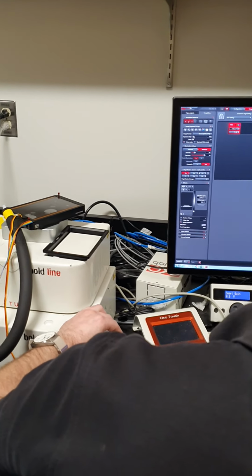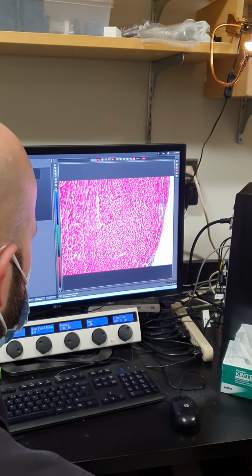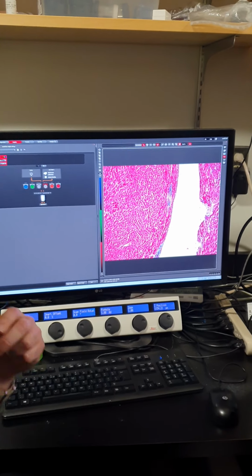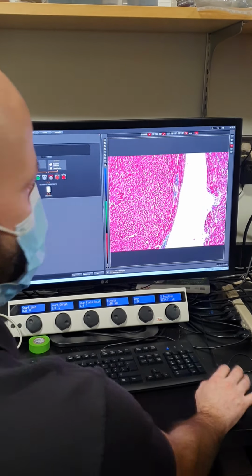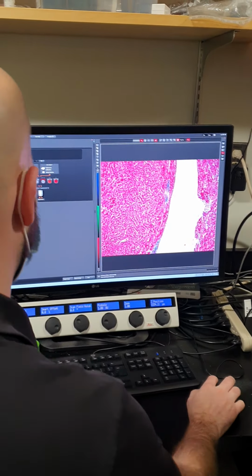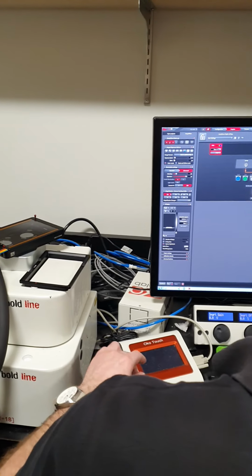And so this is a trichrome stain, so just healthy muscle tissue is pink, and then fibrosis is blue, for example, over here. If we're doing something like this trichrome staining, which is color critical, particularly if we're going to be trying to quantify it based on color, one thing that we probably want to do is make sure that the white balance is correct, so that our colors are accurate and they're consistent between every time that we image.